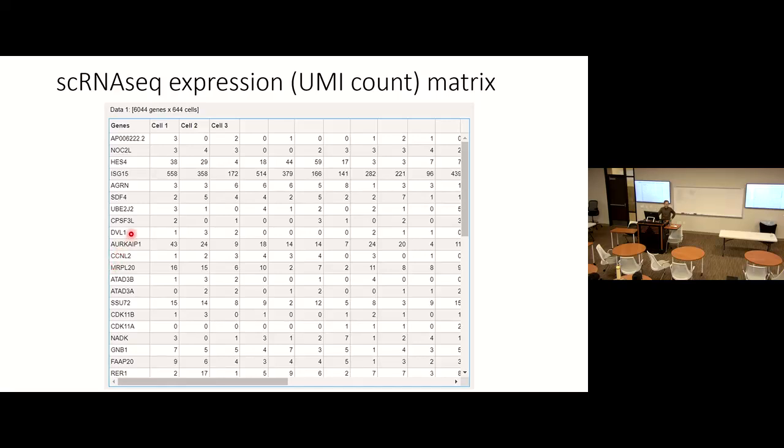Some techniques find the redundant information among these genes, and extract, transform or summarize those covariances and replace the gene expression with something else. Once you do this transformation, there is no longer any gene expression. It could be several genes' expression compressed into one vector. This vector is still a variable, but it doesn't represent any individual gene anymore.